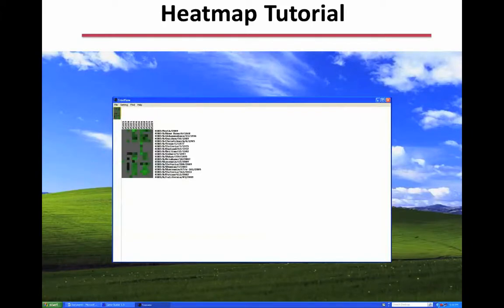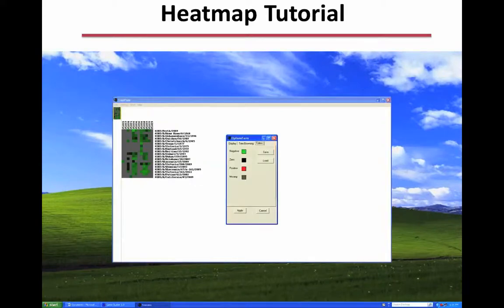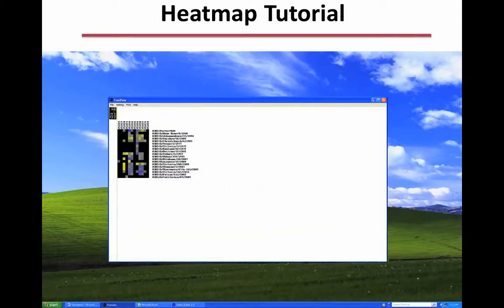The yellow box will select the tree, and you can see here that we have a heat map that looks similar to what I displayed with my data before, but not quite as nice looking, and that's mainly because of the color. So not only because red and green aren't great for colorblind, but just perhaps you prefer another color, and I like to change the colors. And I like to use blue and yellow, but of course it's open for whatever you like.